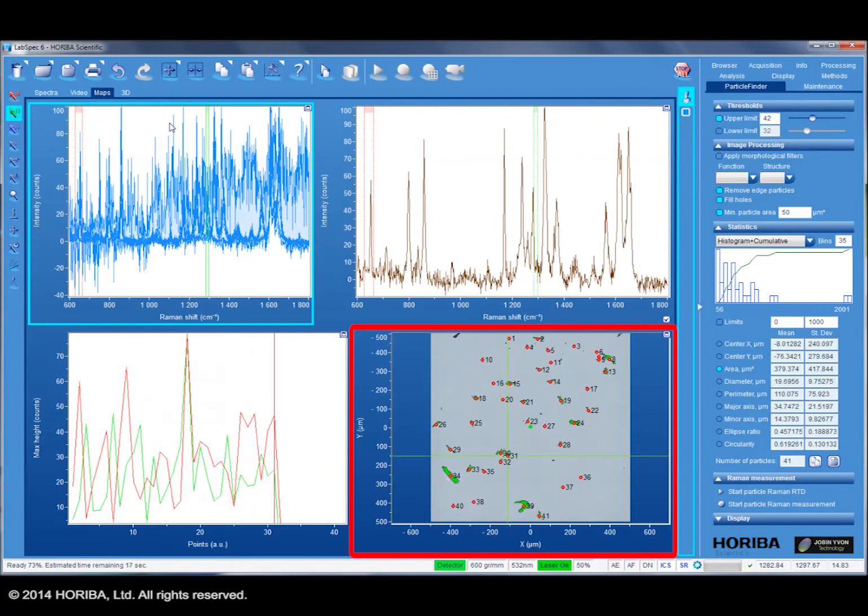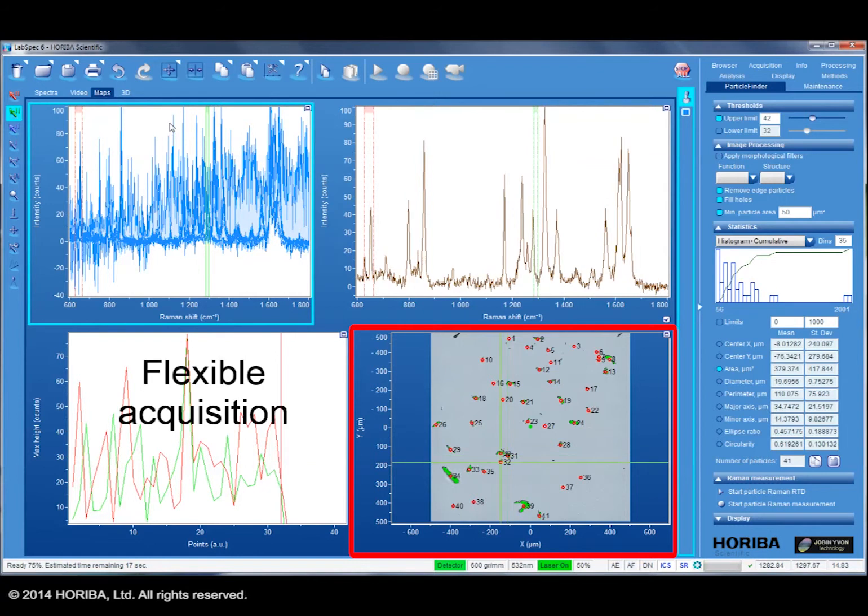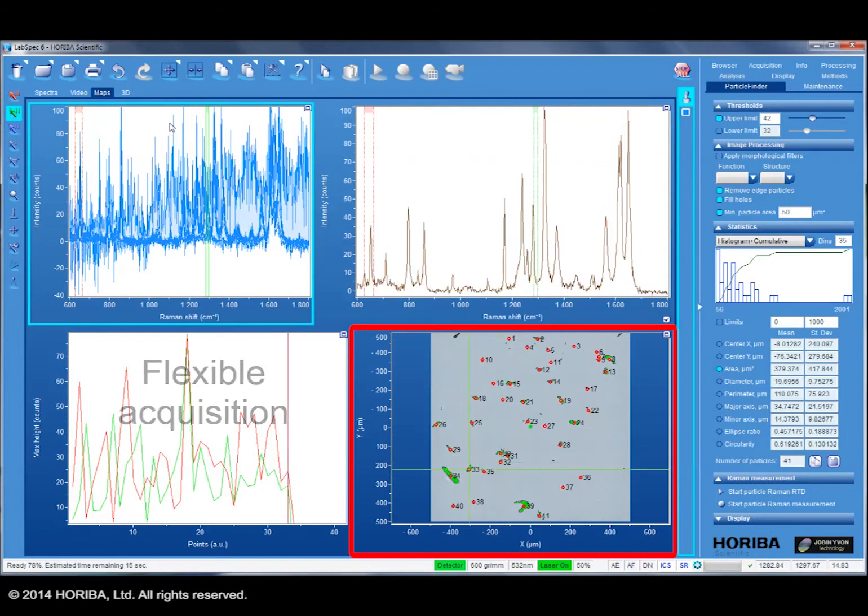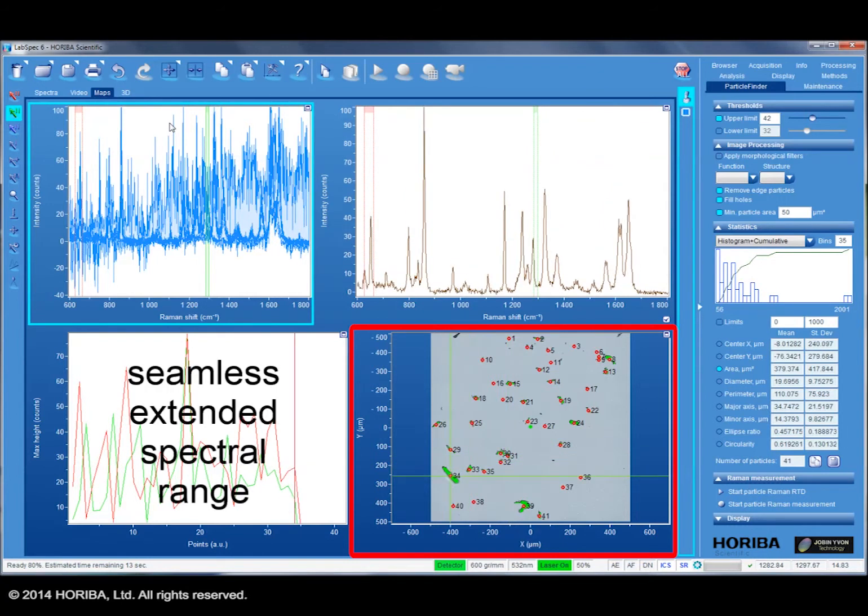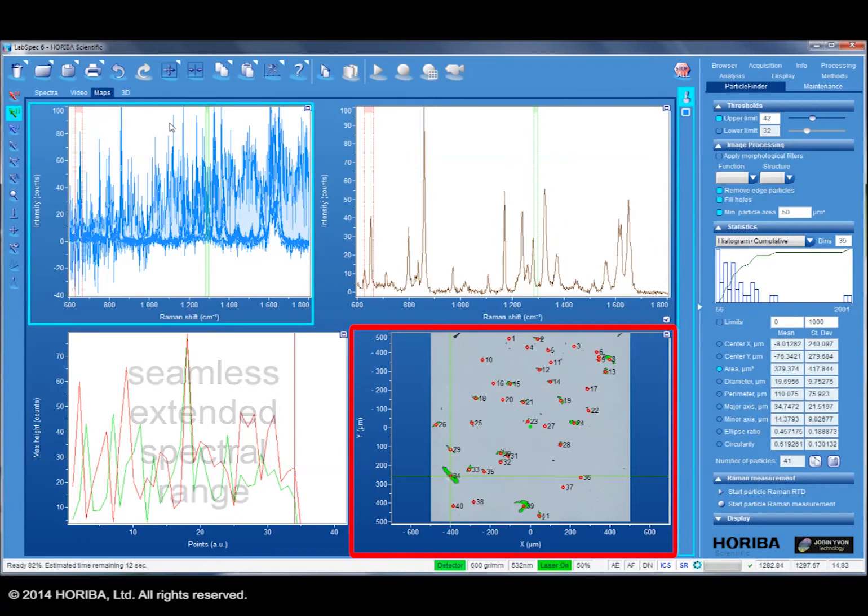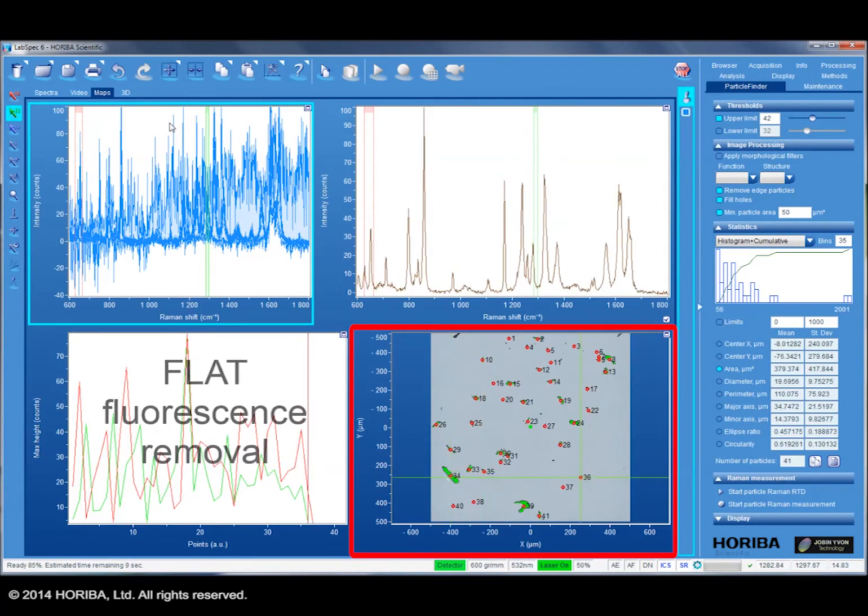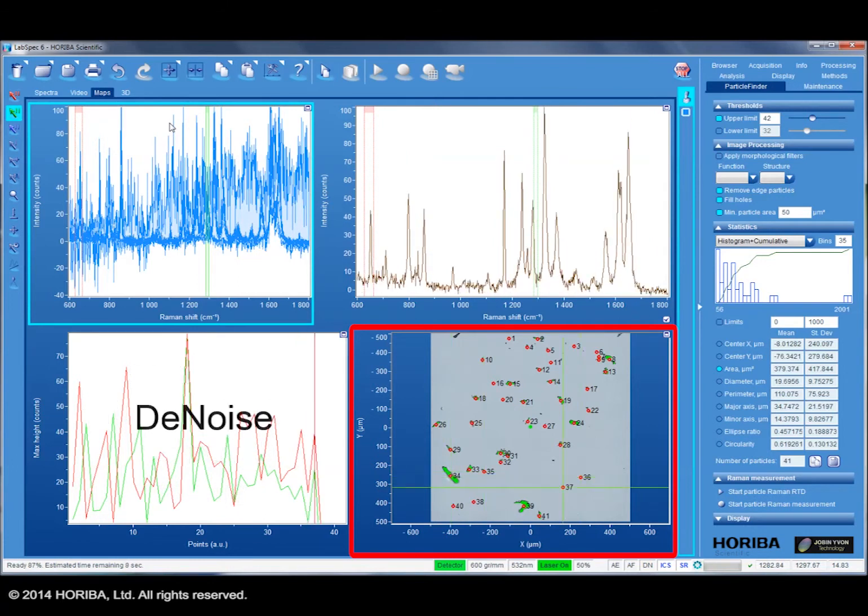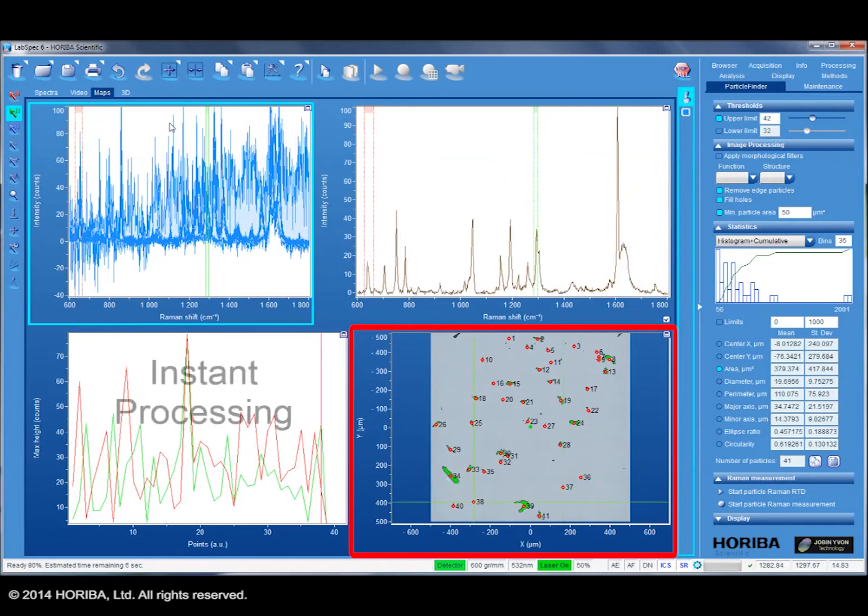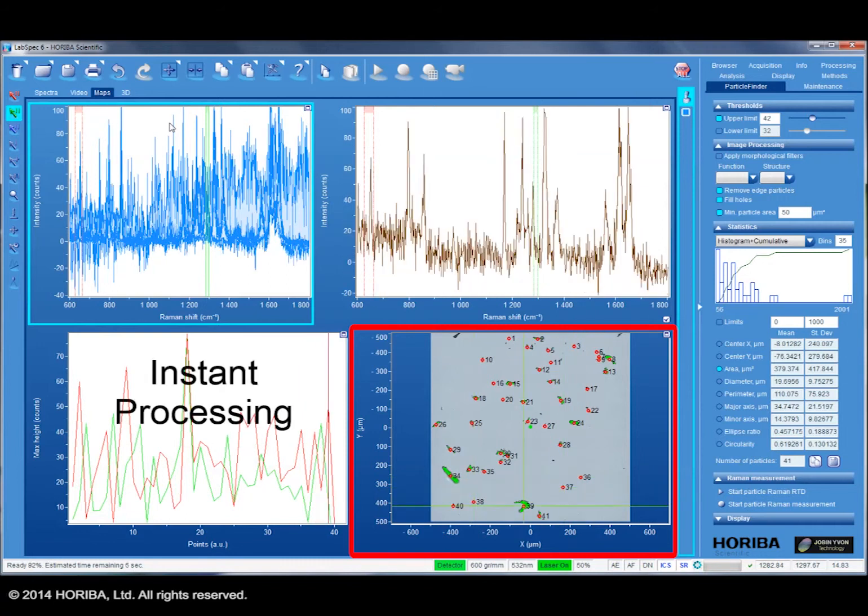In addition, LabSpec's full range of spectrum acquisition functionality is available, including multi-window extended spectral range acquisition, flat fluorescence removal algorithm, denoise data enhancement, and instant processing for on-the-fly data processing and adjustment.